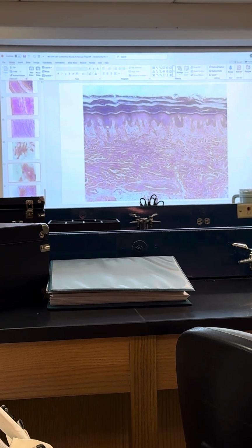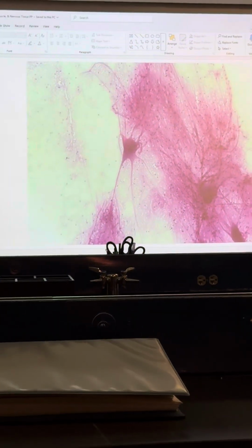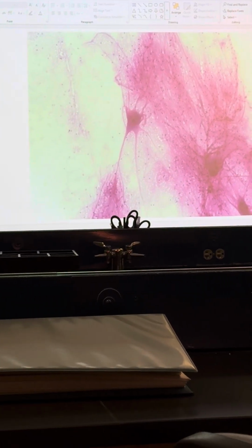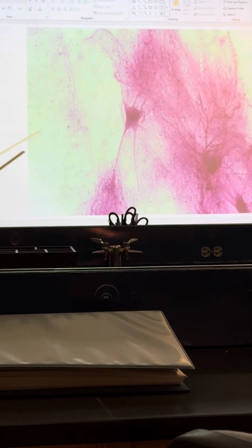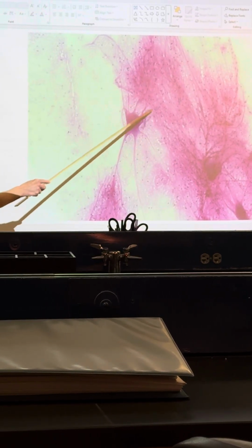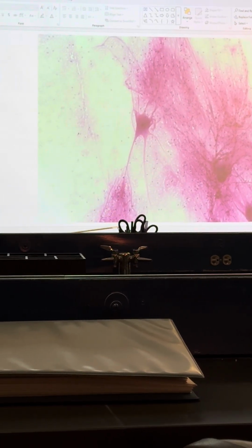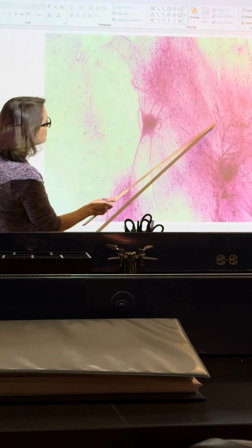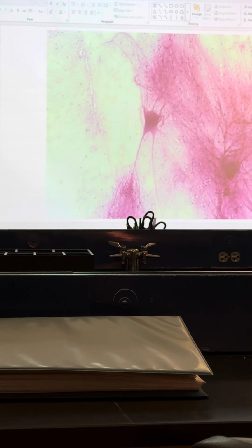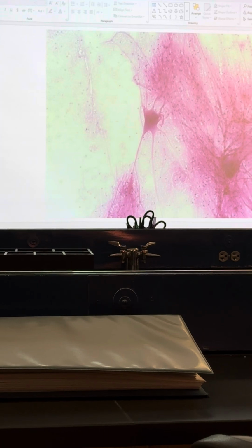Alright, I'm gonna mix them up here. What type of tissue is that? Nervous tissue. What's the big cell there in the middle called? That is our functional cell. Yep, that's the neuron. And what are these called? They could be a dendrite or an axon, right? What are the little cells out here? Those are the supporting cells, neuroglia cells. Did you guys have that one on your list? The supporting cells? Okay, so neuron, we'll stick with neuron there.